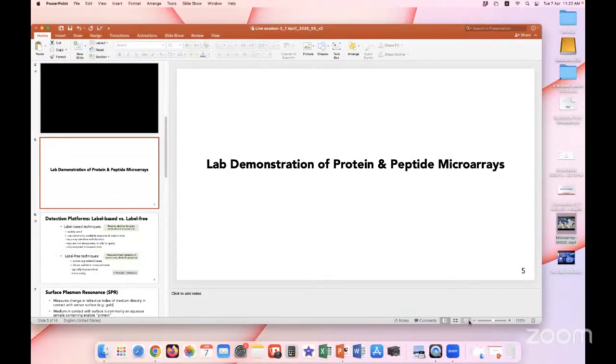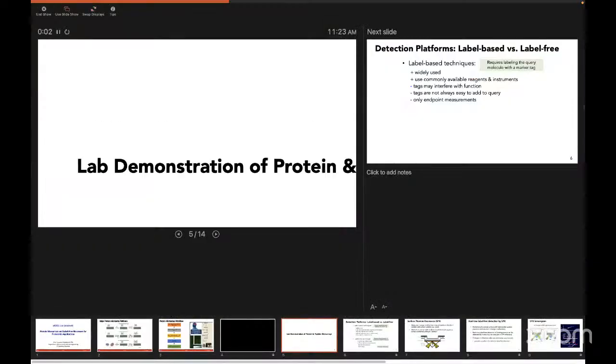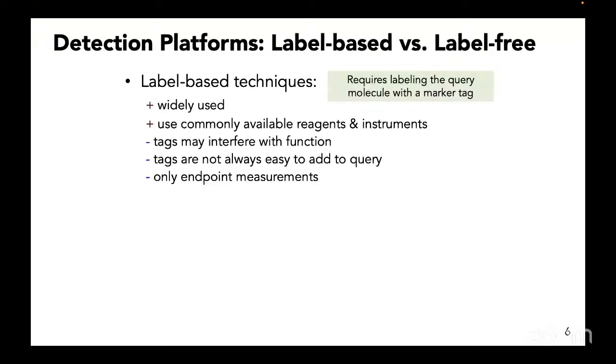Thank you, Arya. I guess the students, you have already been studying protein microarray and peptide microarray in detail. So we thought not to spend too much time on it today, and rather give you a little more flavor of other applications as well. Given what we have seen, protein and peptide microarrays require some sort of tagging, some sort of labeling, and often we use fluorescent-based tags, right?